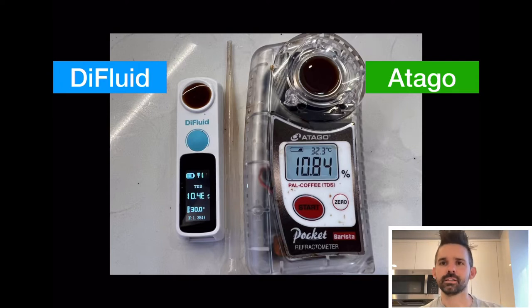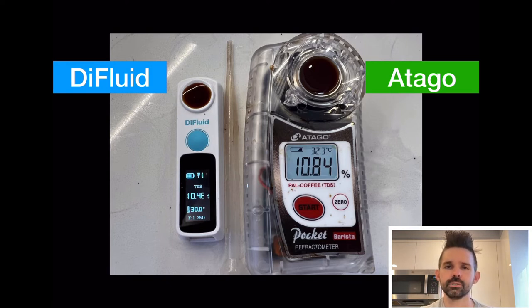Okay, let's talk about refractometers. So I got a DiFluid refractometer recently, which is supposed to be a cheaper digital refractometer than what's available. Right now, to get a cheap refractometer, you have to get an eye refractometer, which is like $25 and can be challenging to read. It's helpful for espresso, but kind of difficult for filter coffee strengths.